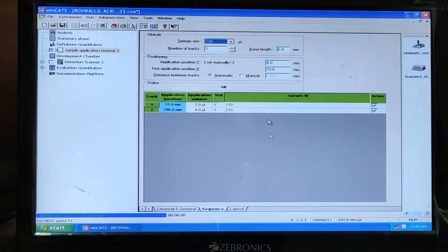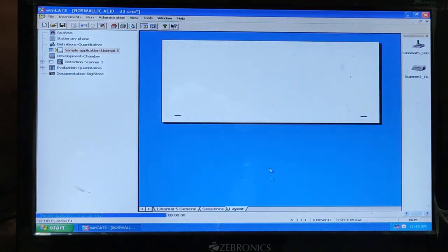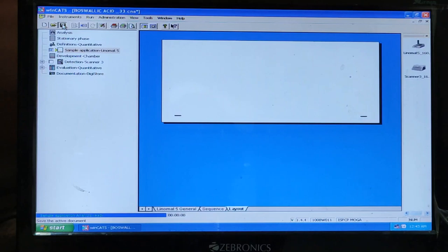So by the help of this software you can set your layout of the plate. So finally just save the method. And you can start. The command will give to the sample injector.